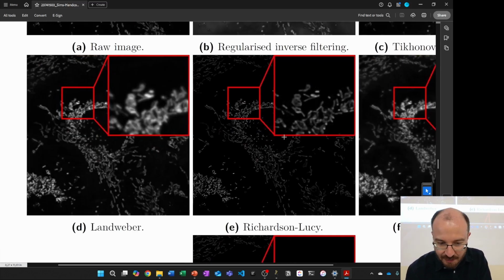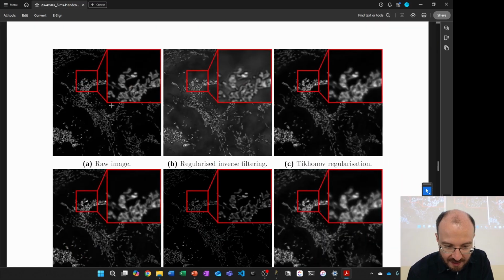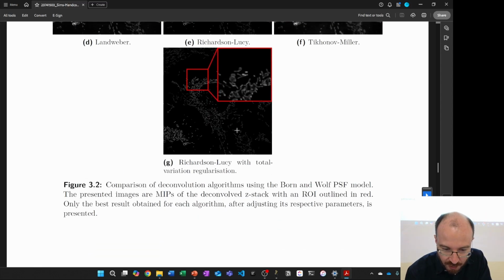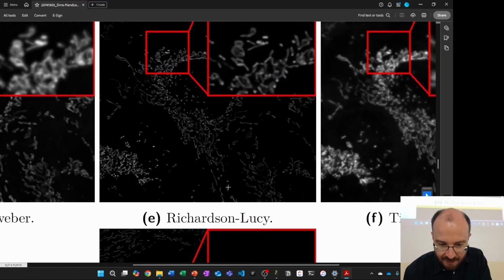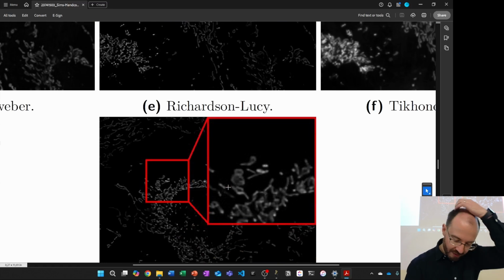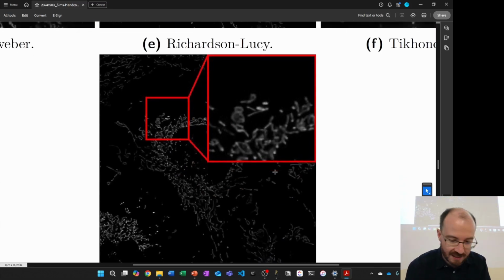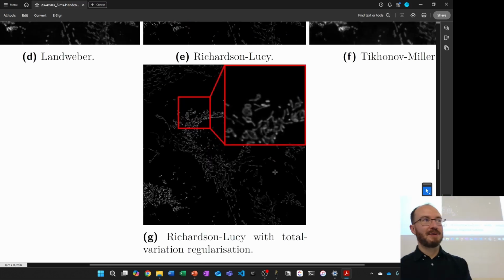This one, this Richardson-Lucy one, is pretty clean. If you just compare these two, it's lowered the intensity, but that's easily fixable. But it's made this thing substantially more clean. And then you can now compare the bottom one, which is Richardson-Lucy with total variation. Now it's very subjective, but after more investigation, we found that this Richardson-Lucy with total variation produced, in our case, the cleanest result.